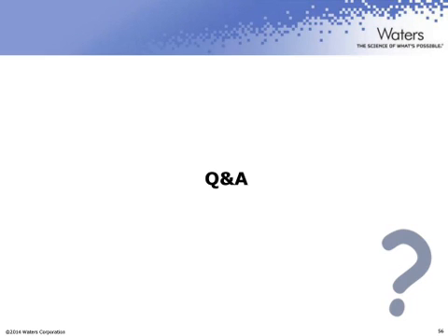Ideally, if we had the time and the inclination, I think every chromatographer could accurately integrate everything by hand. We don't have that time. And as long as all the results are saved, and this is where there can be issues, if you don't save that manual integration so that you can pull it up identically to how the analyst did it, then trying to avoid manual integration is critical. However, if those results are saved, including where the peak starts and ends were, there's no concern at all that it was not as you're looking at it when it was processed.